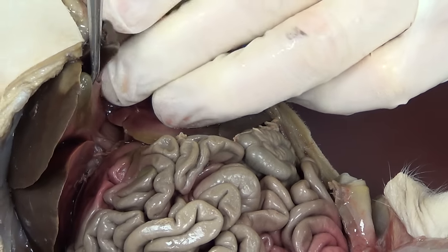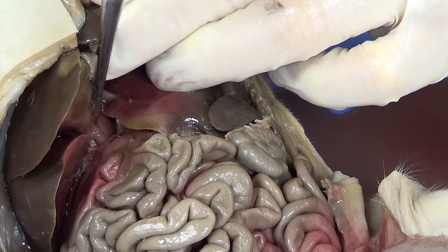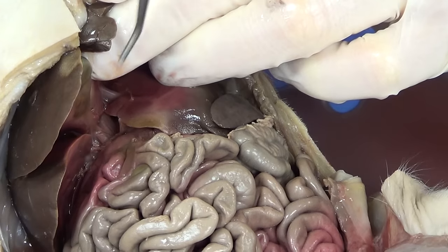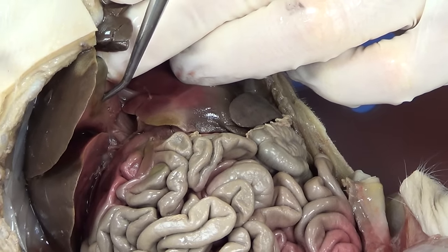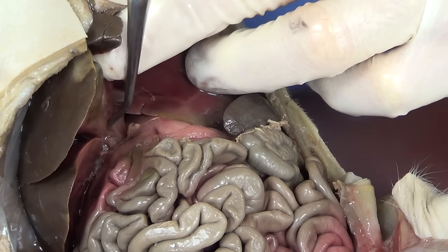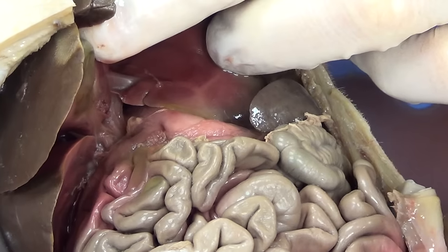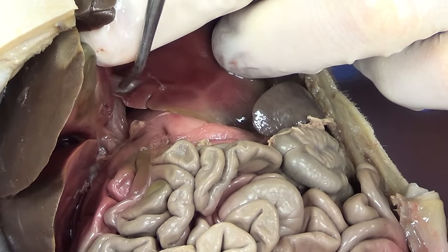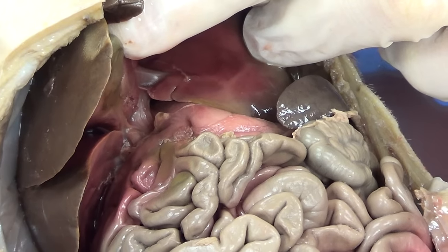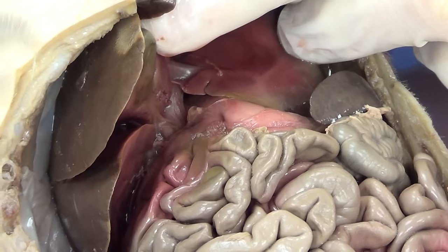If we look down here a little bit further, you can see a small tube leading away from the gallbladder — be very careful, it's a very delicate tube. That tube-like structure is the cystic duct, and that is going to move bile away from the gallbladder. The liver is going to have its own tube called the hepatic duct, and the cystic duct and the hepatic duct come together to form a common bile duct. The bile will get put into the first part of the small intestine, where it will do its work.